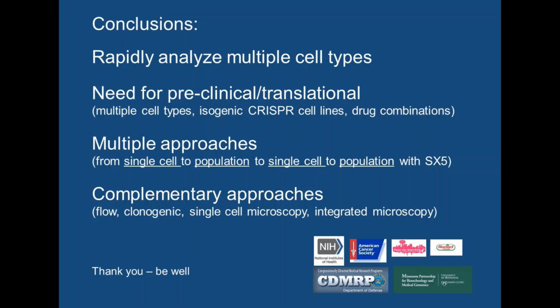We continue to do flow cytometry and clonogenic assays, our single cell microscopy, which is really our core technique in the laboratory, and this integrated microscopy and analysis system with Incucyte. We think these all complement each other.